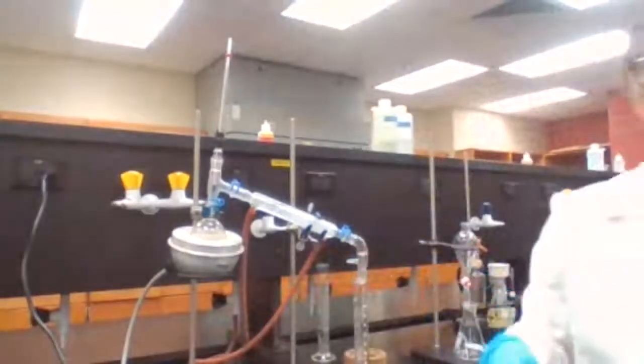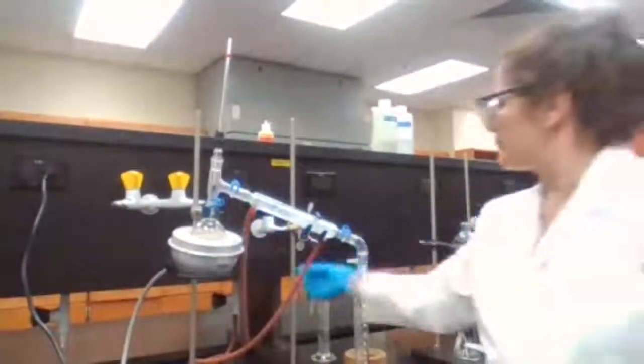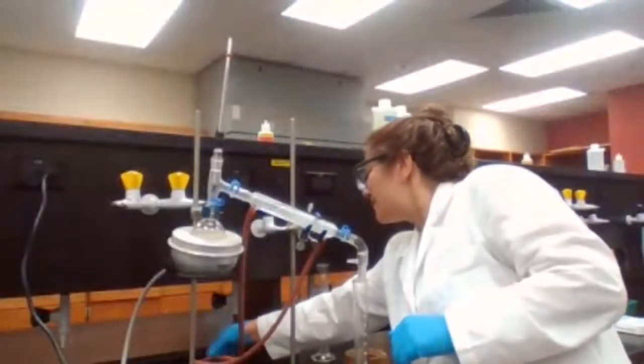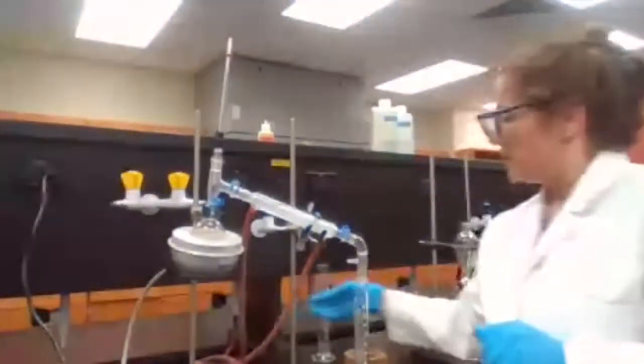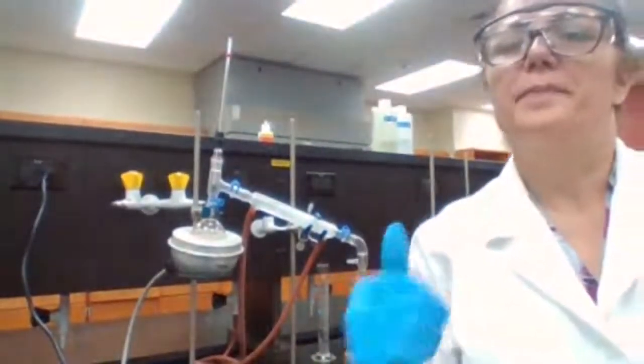Okay. Any questions you have? So add a spatula of sodium chloride in order to make sure that the two layers can be distinguished.